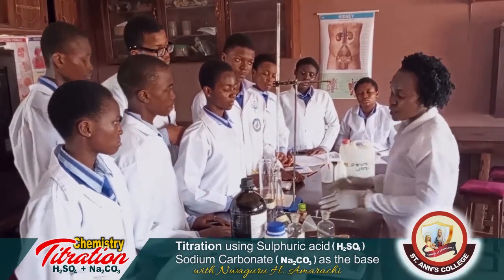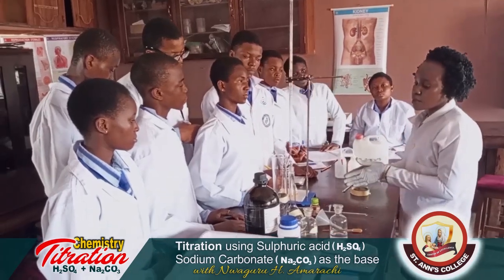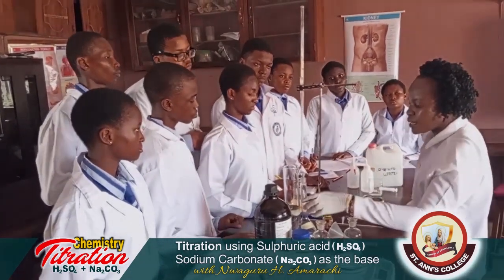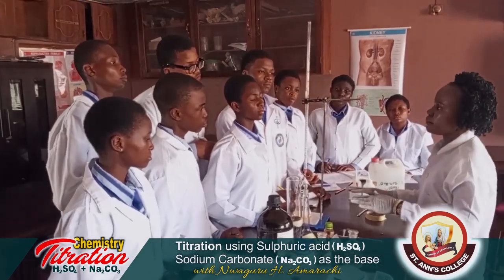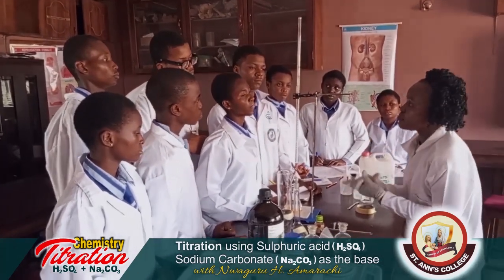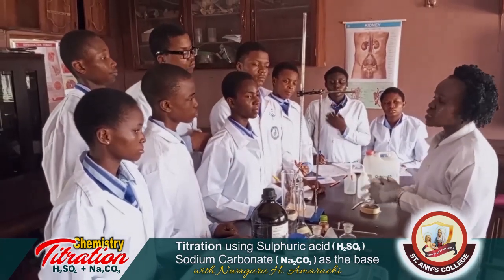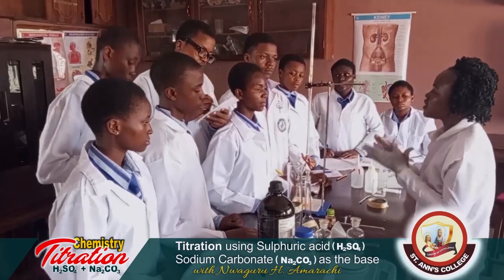But in your measurements, when preparing your acids and your base, make sure that the measurements you're using for the dilution are the same. If you're using 1000 ml, make sure that it's a 1000 ml volumetric flask. If you're using 500, make sure that whatever you're substituting with is 500.